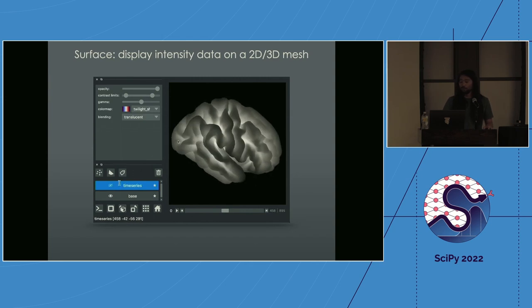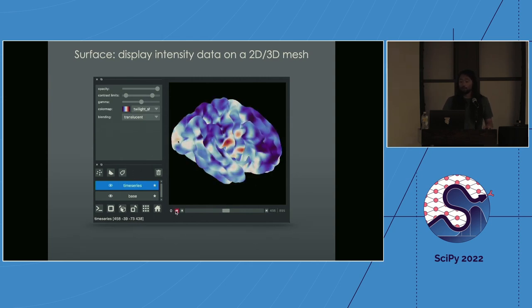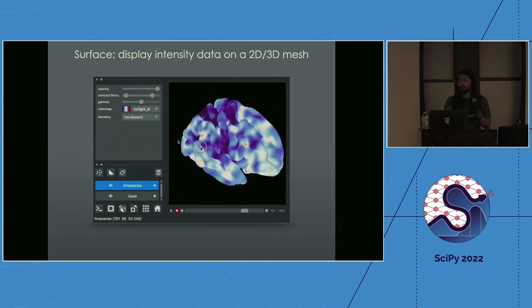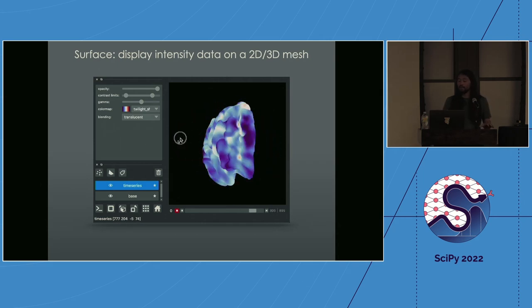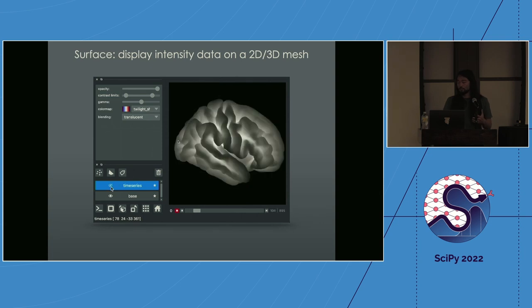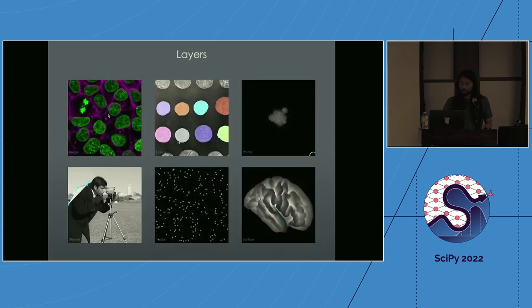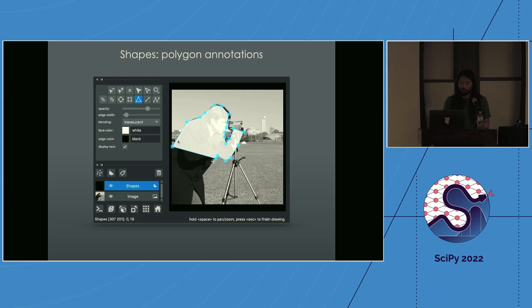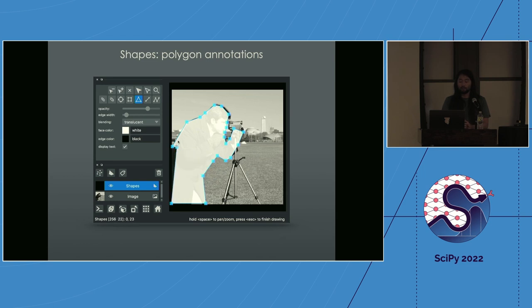For surface data — for example fMRI data as a proxy for brain activity — the surface layer lets you define a surface as a polygon mesh and color it based on a measured value. This works both statically and as a time series in 3D. Finally, the shapes layer is for polygon annotations — useful if you have regions of interest like the boundaries of a tumor in a large slide, allowing you to make, store, and share annotations with collaborators.